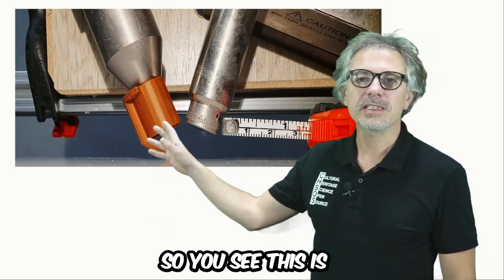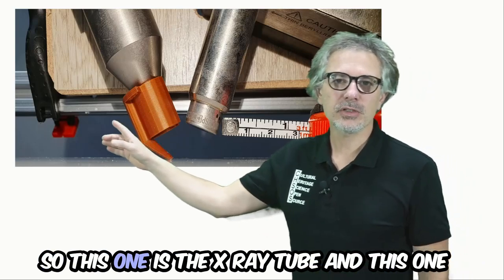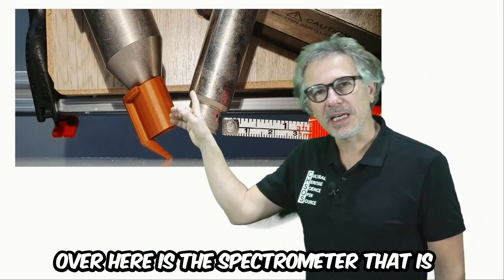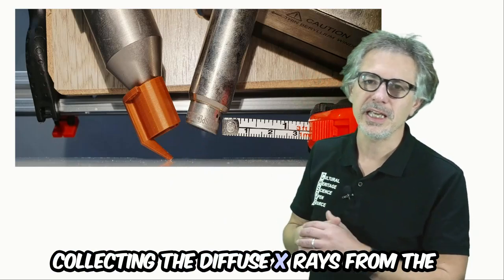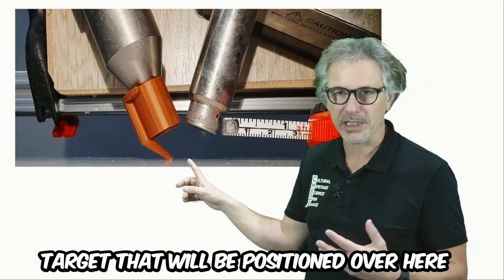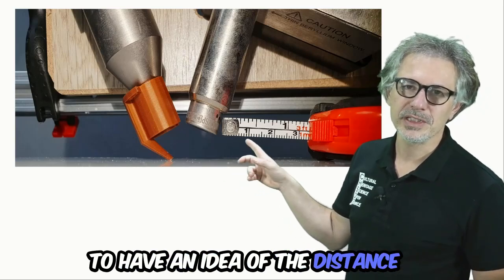This is a close-up photo of our system. This is the X-ray tube, and this over here is the spectrometer that is collecting the diffused X-rays from the target, which will be positioned over here. Over here I put a ruler just to have an idea of the distance.